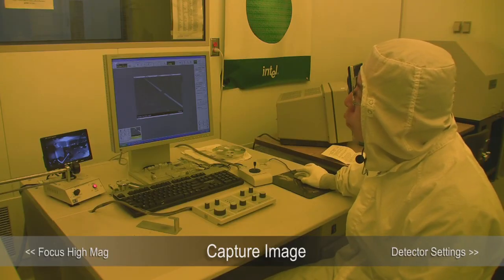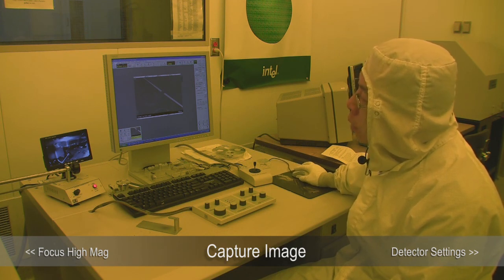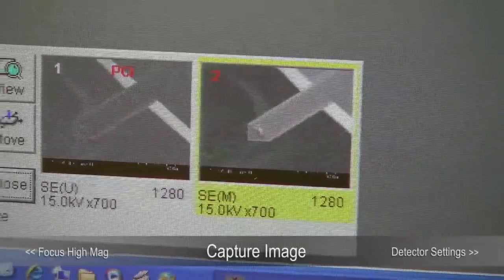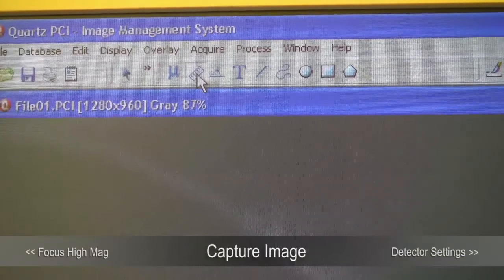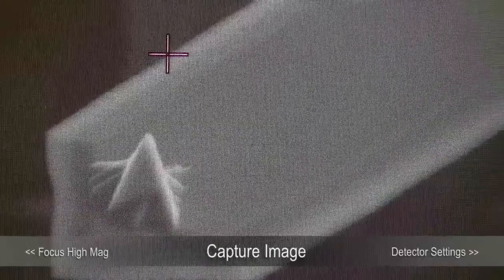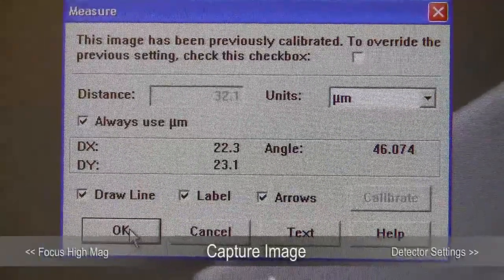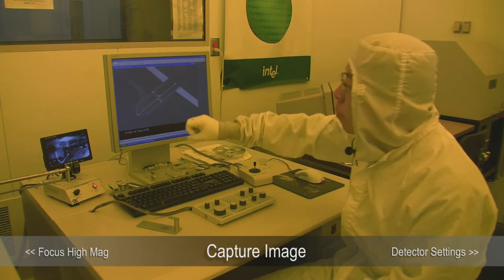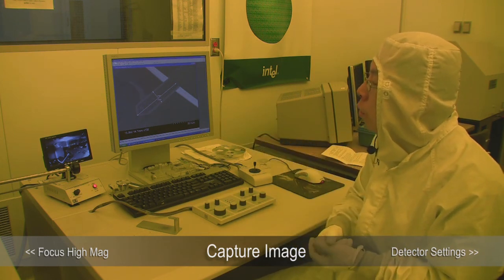After you capture the image, you can do some measurement. Select the picture and open the PCI software — that's another software that allows you to measure the dimensions of the sample. In the PCI software, select the measuring tool, which will allow you to measure the width of the cantilever. Left-click and hold on the first point, drag to the final point, release, and click OK. You can also measure the length and how sharp your tip is, doing quantitative measurements on your image.